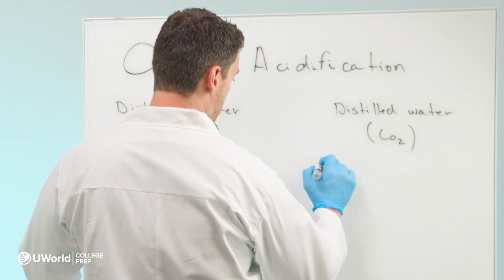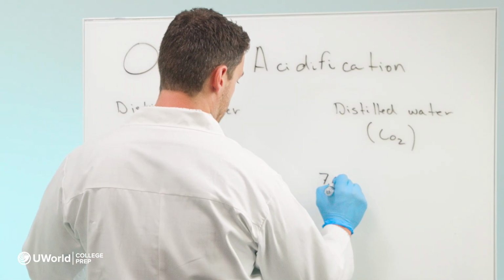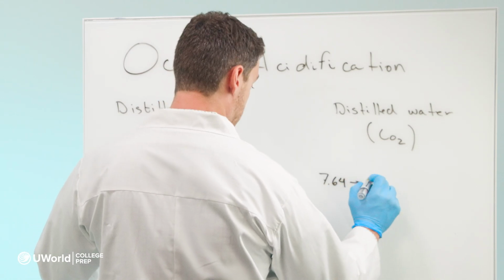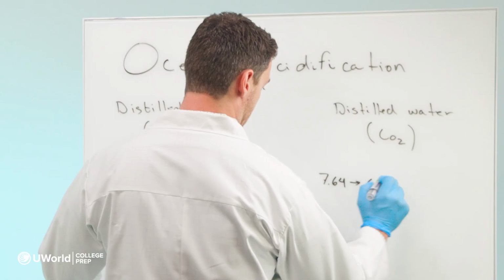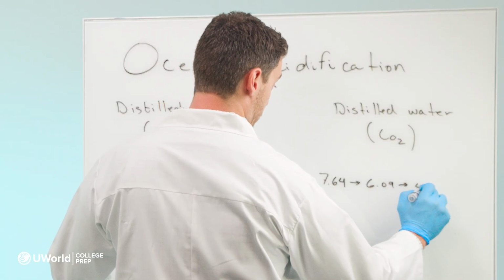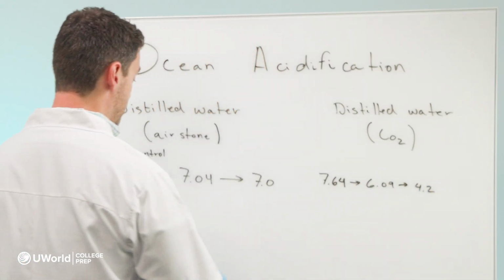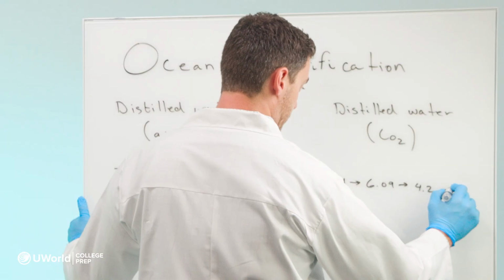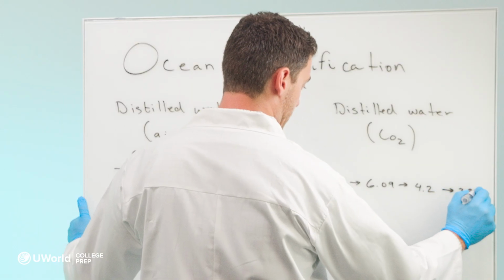And our pH started at about 7.64, then went to 6.09. After a minute, it was 4.2, which is a huge difference from what we had here. And then after that other minute, we ended at 3.96.